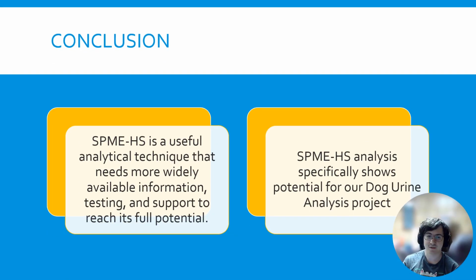So the conclusion is that solid phase microextraction of the headspace is a useful analytical technique that needs more support, more testing, and more information, because right now there's not a whole lot of widely available information on methodology, how tests are run, and general support for this method.